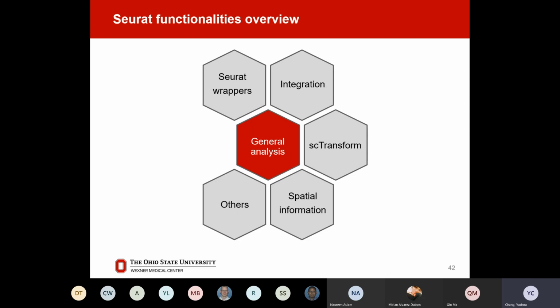It can simultaneously generate spatial information and transcriptomic information. This technology was developed, I think, late last year, and the Seurat group quickly developed a corresponding pipeline for it. So we can see the Seurat group is very admirable, because they always provide pioneering pipelines for highly advanced technology.